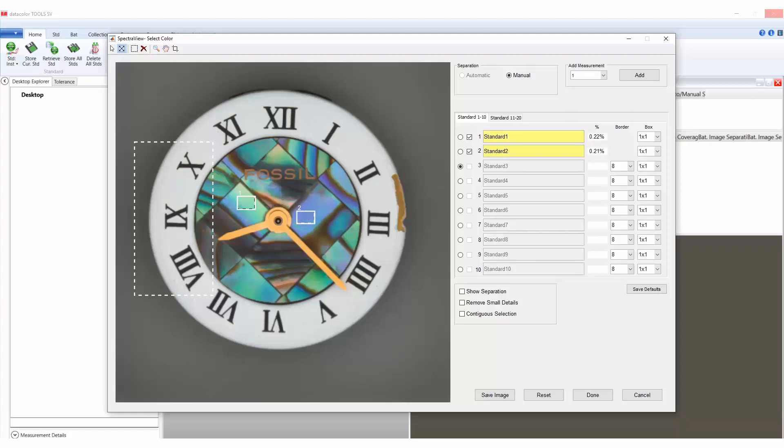For the remaining regional selection, we want to capture individual components that may or may not be of the same color. To accomplish this, we will use the contiguous selection with the remaining regional box selection. Start by choosing the select colors icon at the top of the color measurement window — the icon will change to an arrow shape. Select the white background color within the regional box, then select show separation to see the separation based on the default border 8. Change the border by selecting the dropdown to choose the desired border; we will use border 2 for the white color.